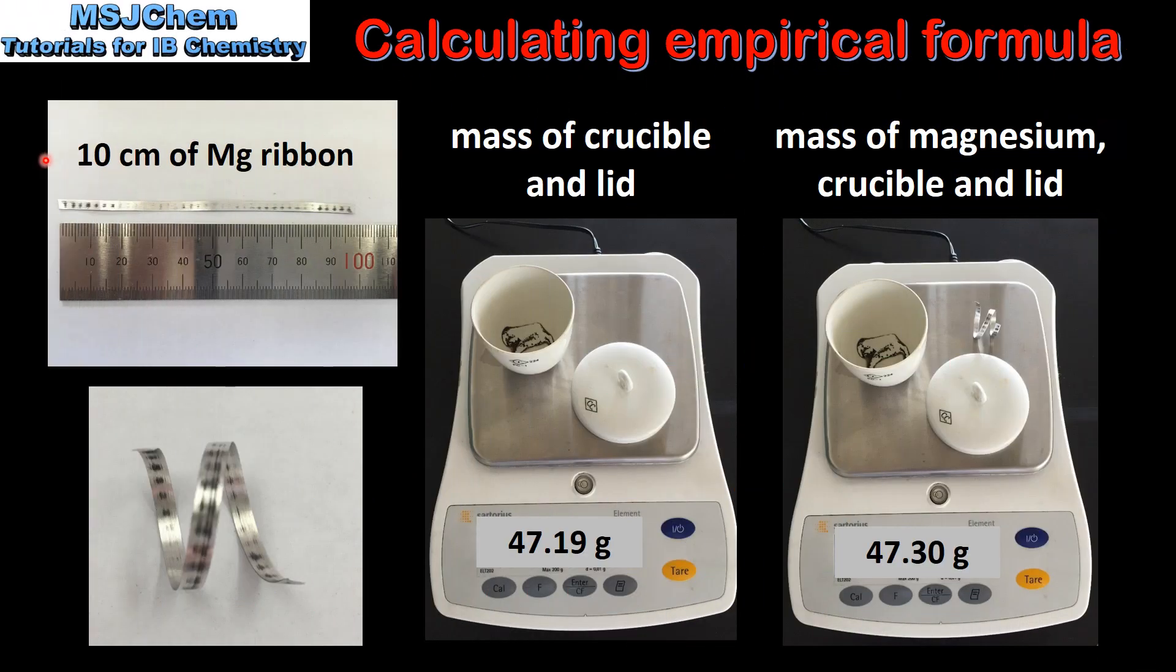We start the experiment by measuring 10 cm of magnesium ribbon. Next, the magnesium ribbon is wrapped around a pencil to form a coil.